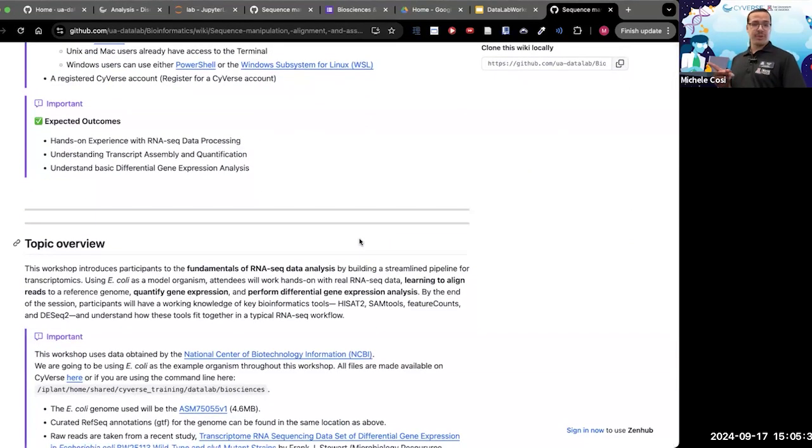I see that you guys have your computer, so good, because Haley has already started the Bioscience app on CyVerse. Otherwise, that is the next step that we need to do, starting the Bioscience app on CyVerse. And how do you do that? Alrighty, I'm going to show you.